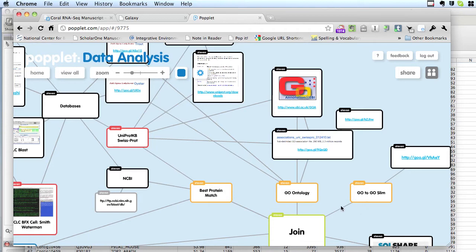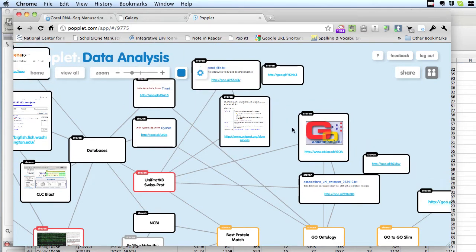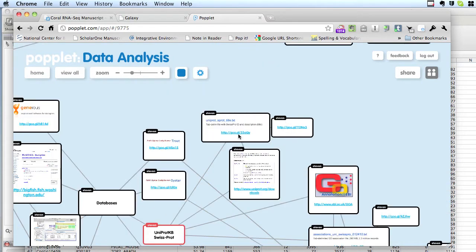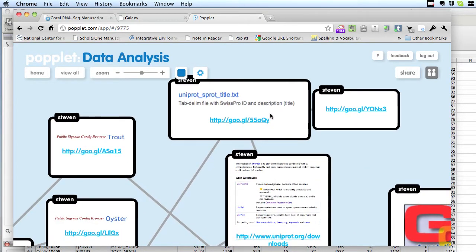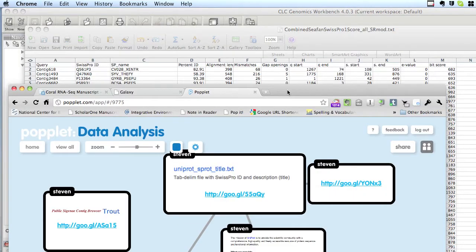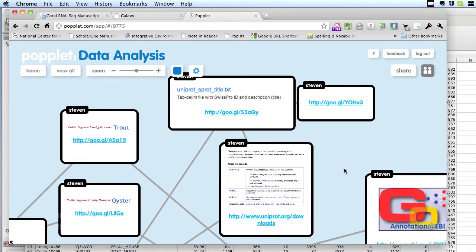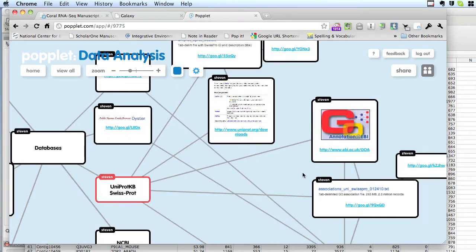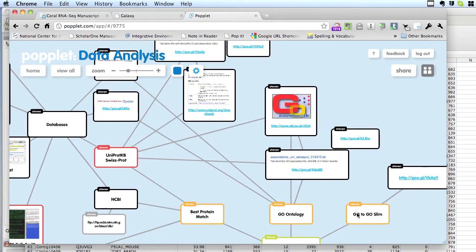And now I want to join these Swiss-Prot hits. I actually want to get an identifier, which I can get because I've got a table indicated by this file accessible here. It has the Swiss-Prot ID and the description. So she's provided the Swiss-Prot ID right there. Take that, link it to this file, and get a description. We'll do that first, in Galaxy, and then go from there to get the GO ontologies.